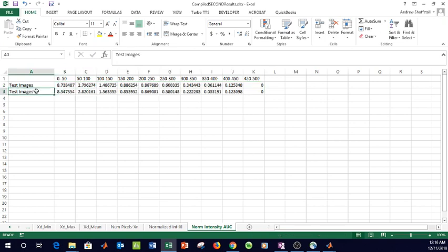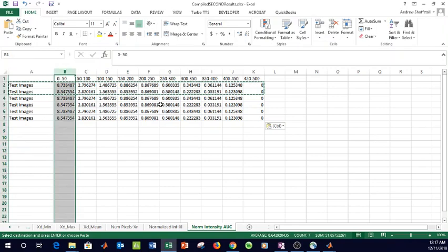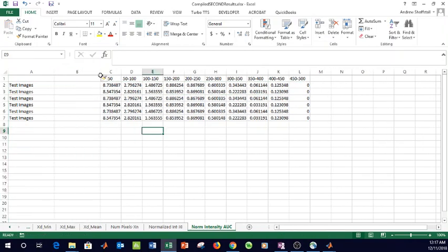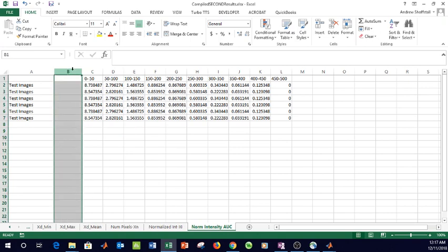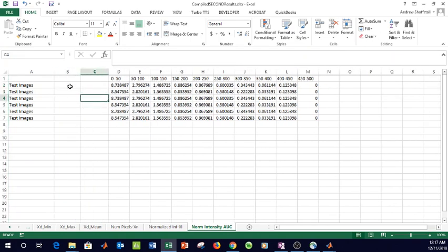This is obviously the same image twice, but something that I will frequently do, I'm just going to add a couple more so it looks more like a data set. I will always add a couple columns here that describe what these are. So we always run our analysis completely blind to what these samples are.